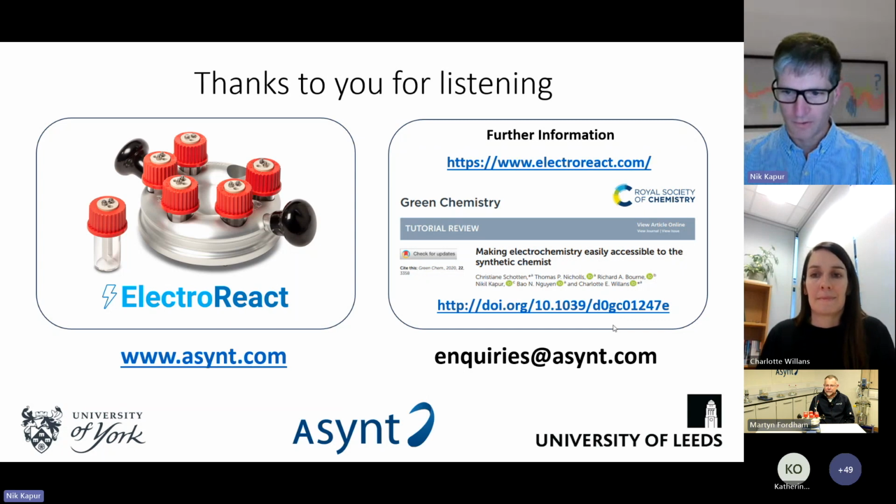Can this technology be implemented into flow processes? Yeah, absolutely. When I started working with Charlotte initially, we continued to work on flow electrochemistry. Here there are 2 electrodes that are held a fixed distance apart, and a flow path between those. And we have published in that area. So electrochemistry is certainly amenable to flow processes as well.